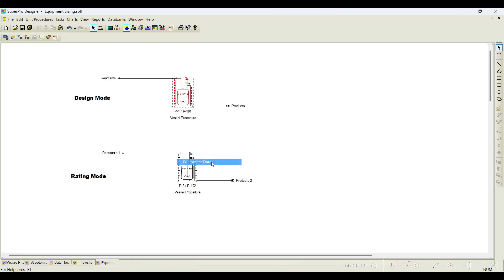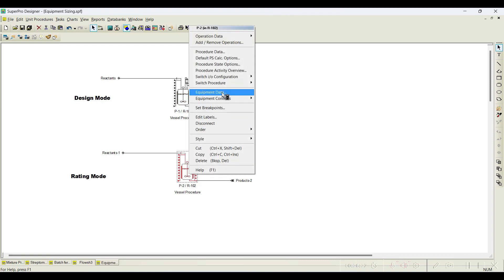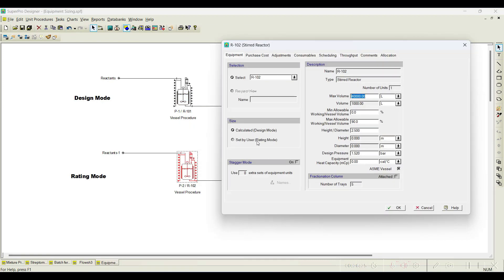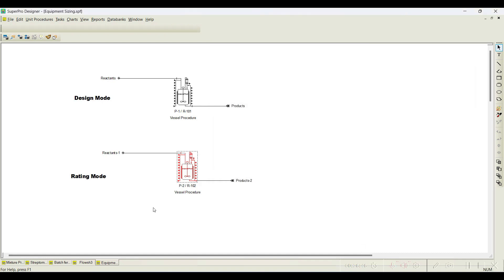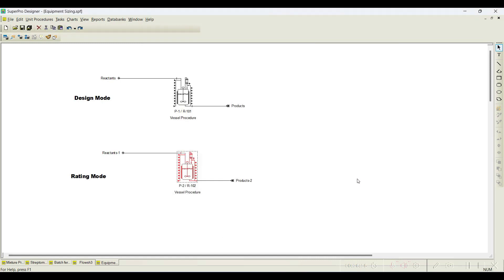In the design mode case, if you go to equipment data, the maximum volume is set to 40,000 liters and initially it will be 1000 liters — it will change after calculation. For the rating mode case, I go to equipment data, select rating mode, and the initial volume is 1000 liters. Since 1000 liters is not sufficient, I will set it to 10,000 liters — that is the equipment available to me. Click OK.